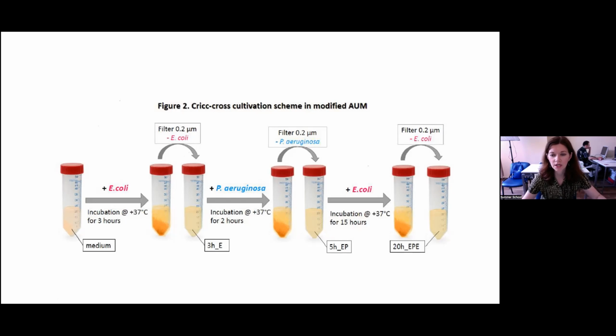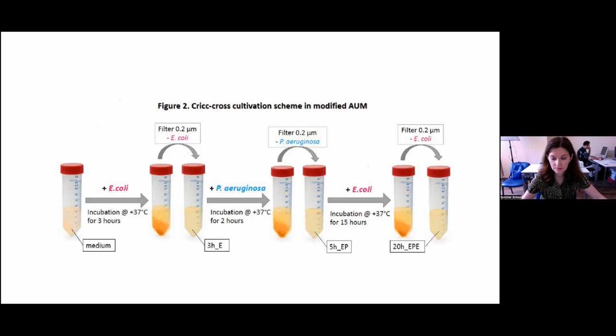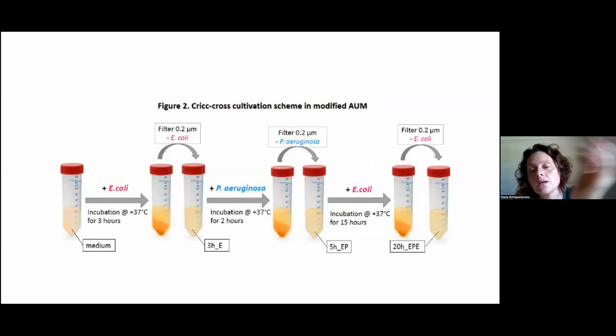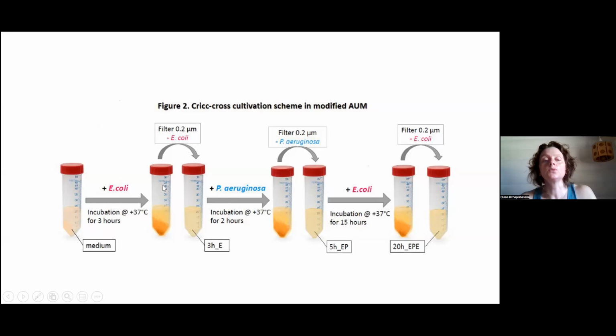Yes, I have a question. The final medium, which was incubated for 20 hours, was without bacteria at all, right? Yeah, in the end we also remove bacteria, of course, because we take only a sample without the bacteria. We just want to have the supernatant. We remove bacteria by filter. And what was the idea of incubation for 20 hours? Yeah, E. coli is growing there for 20 hours till the end, so then we will have some final product. Then it is removed, and then you analyze. Okay, thank you. Yeah, we analyze all these tubes too.